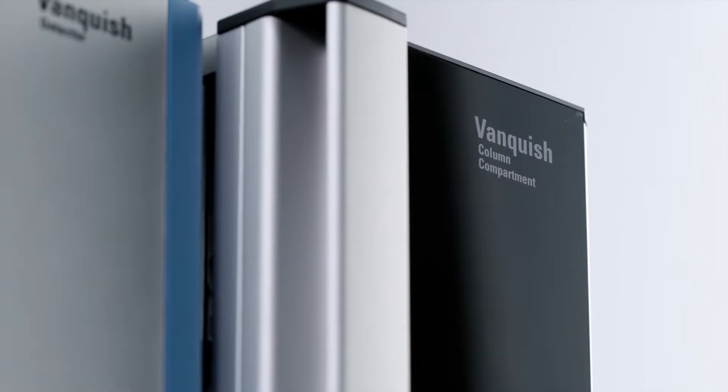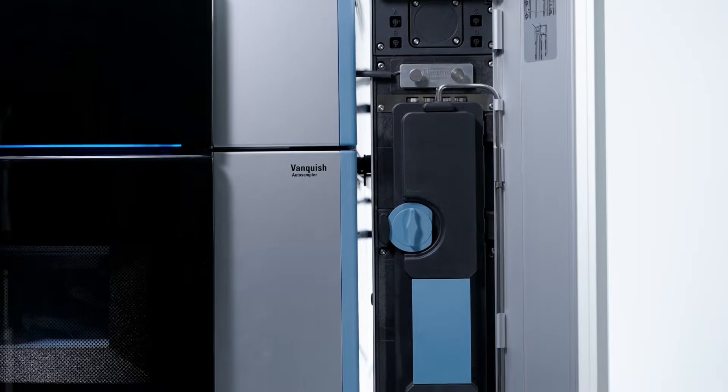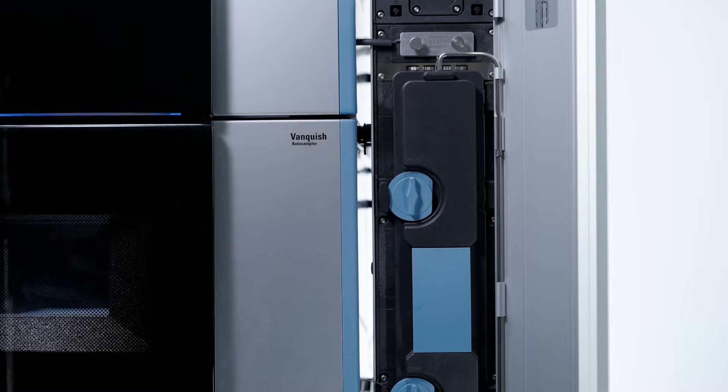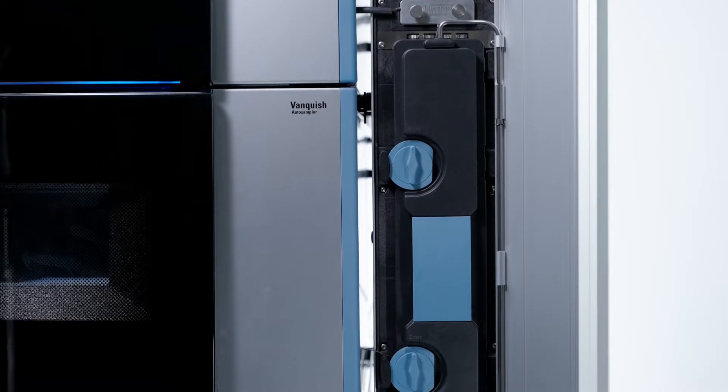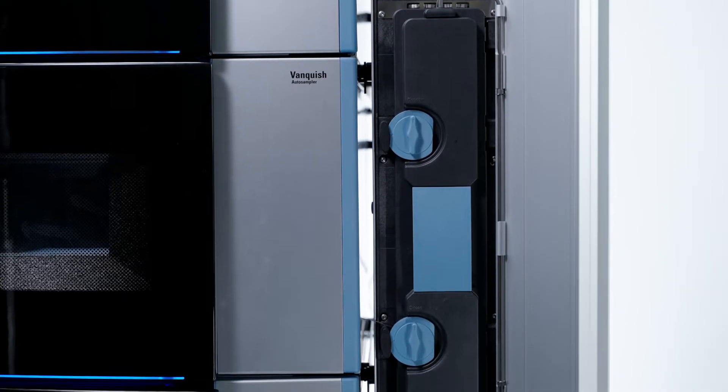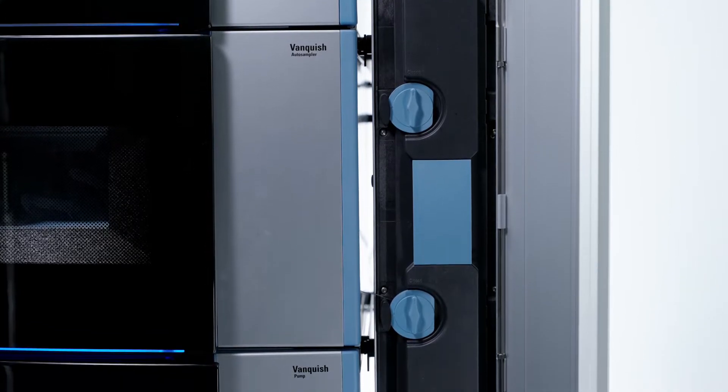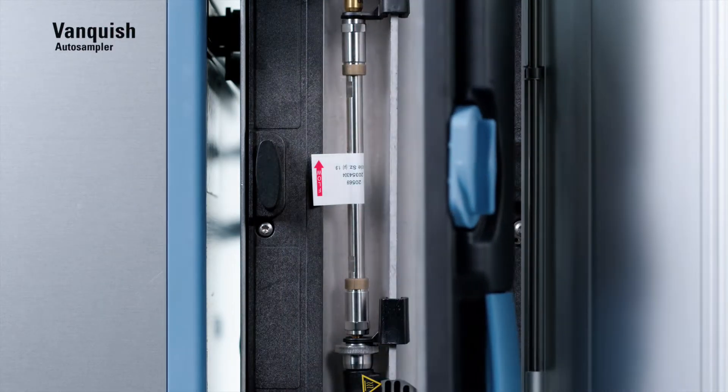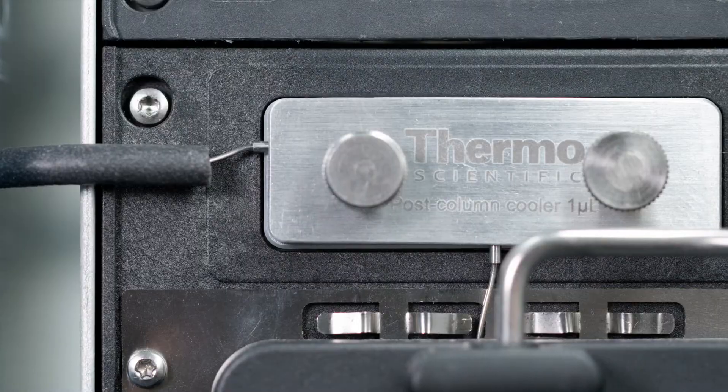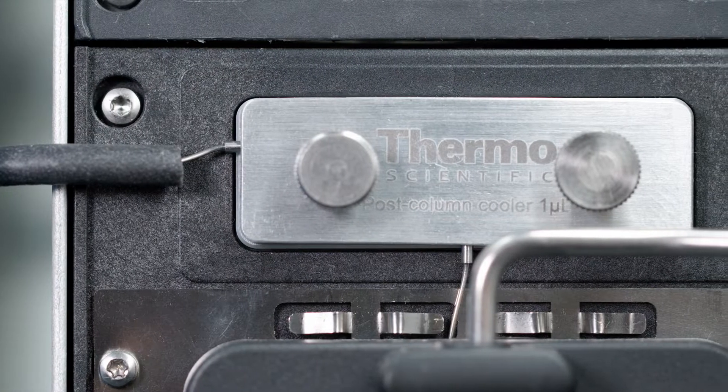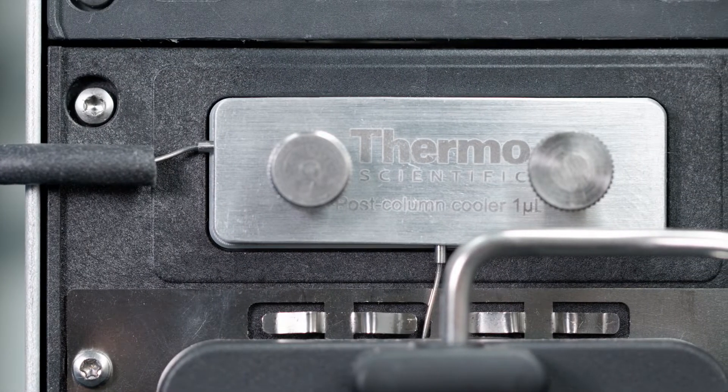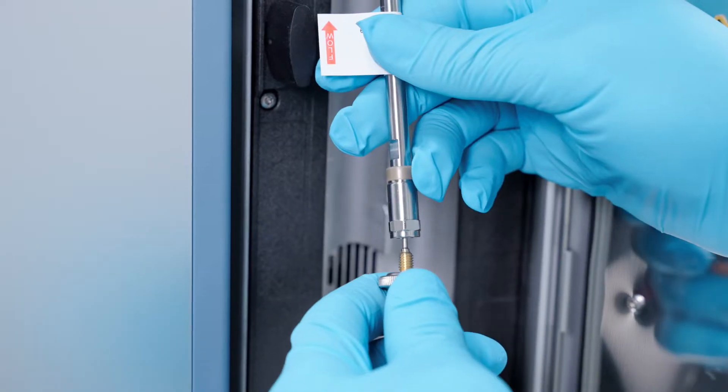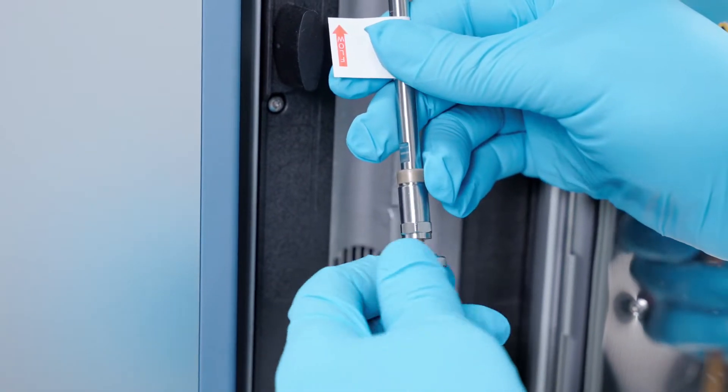The Vanquish Column Compartment supports still and forced air heating modes, allowing you to maximize resolution with sub-2 micron columns, including Thermo Scientific Hypersil Gold Vanquish Columns.